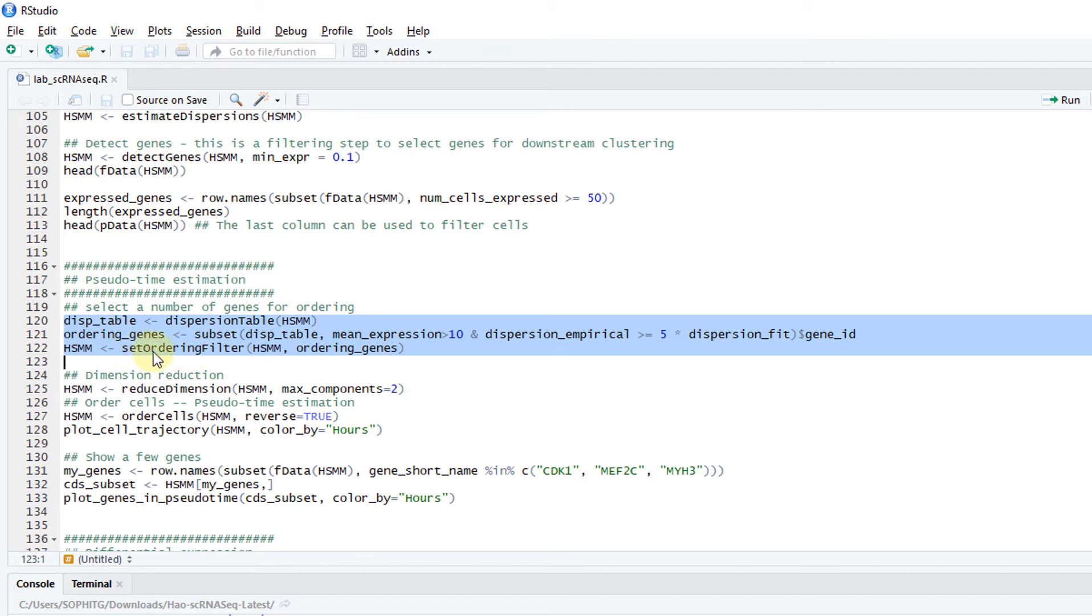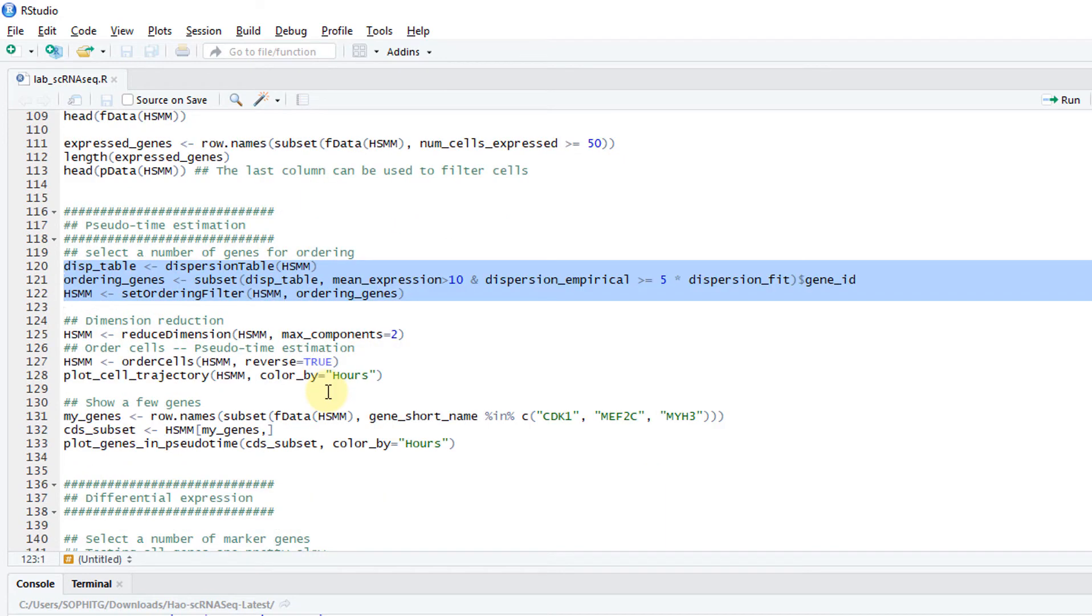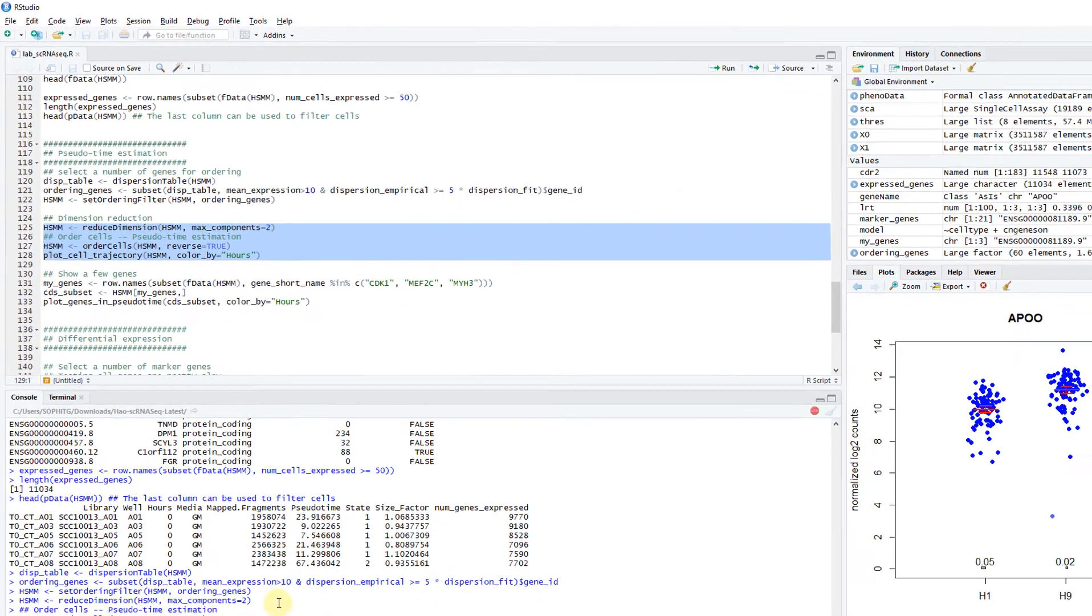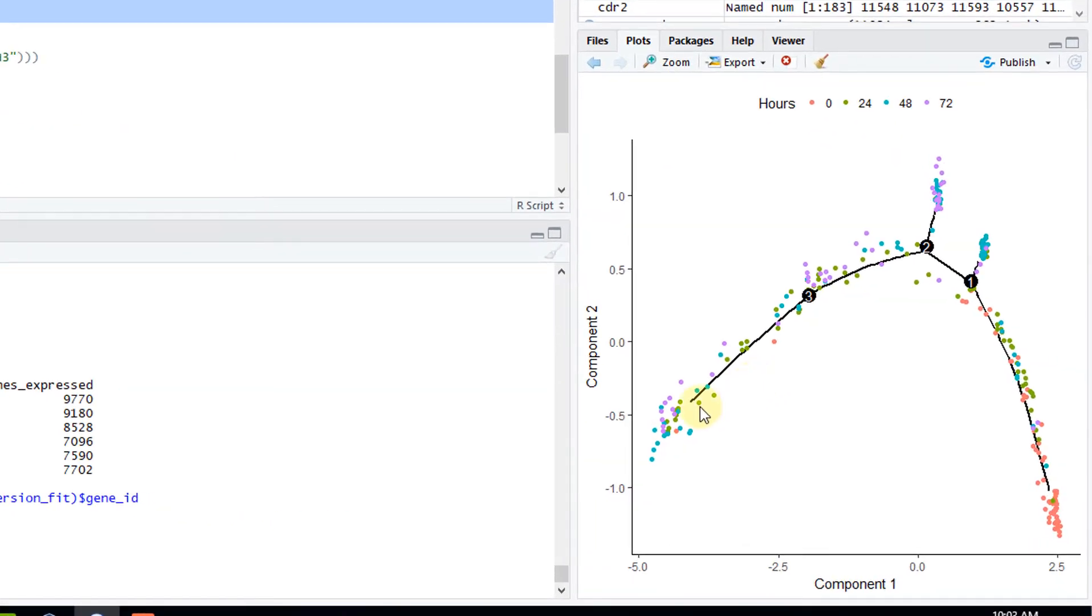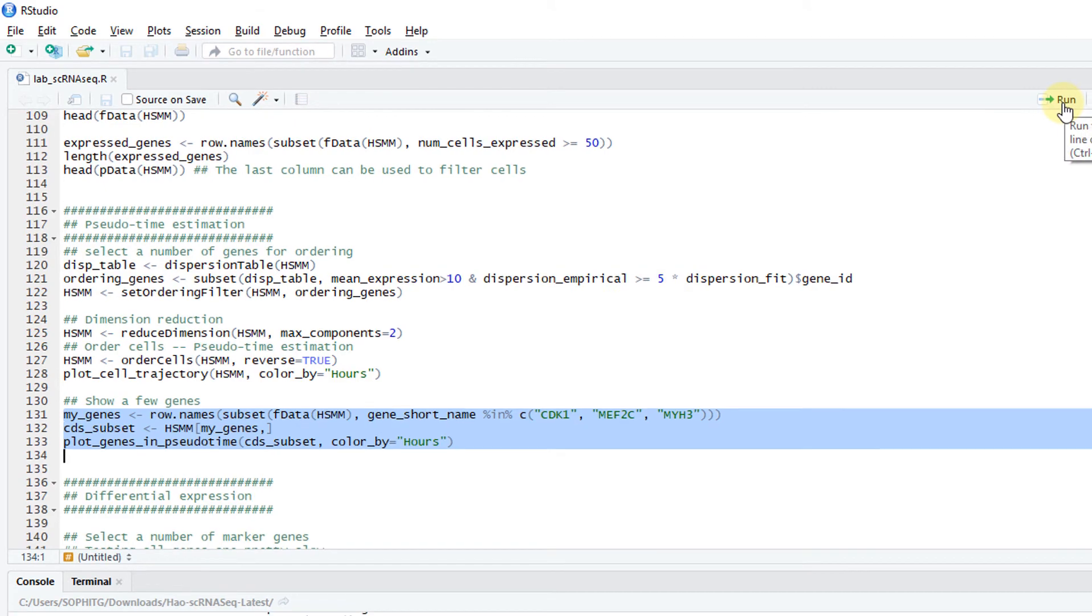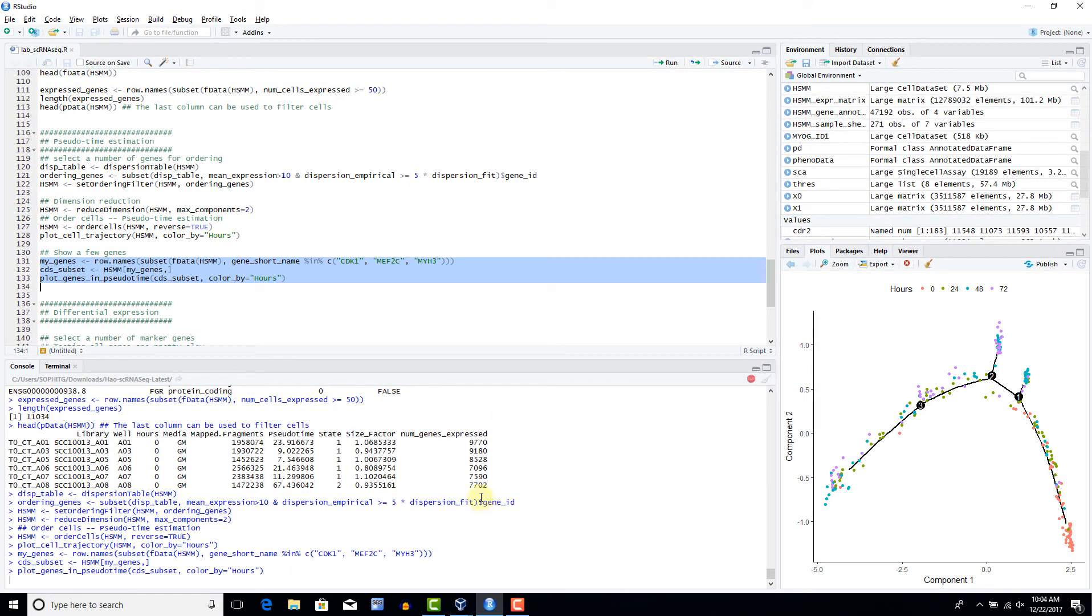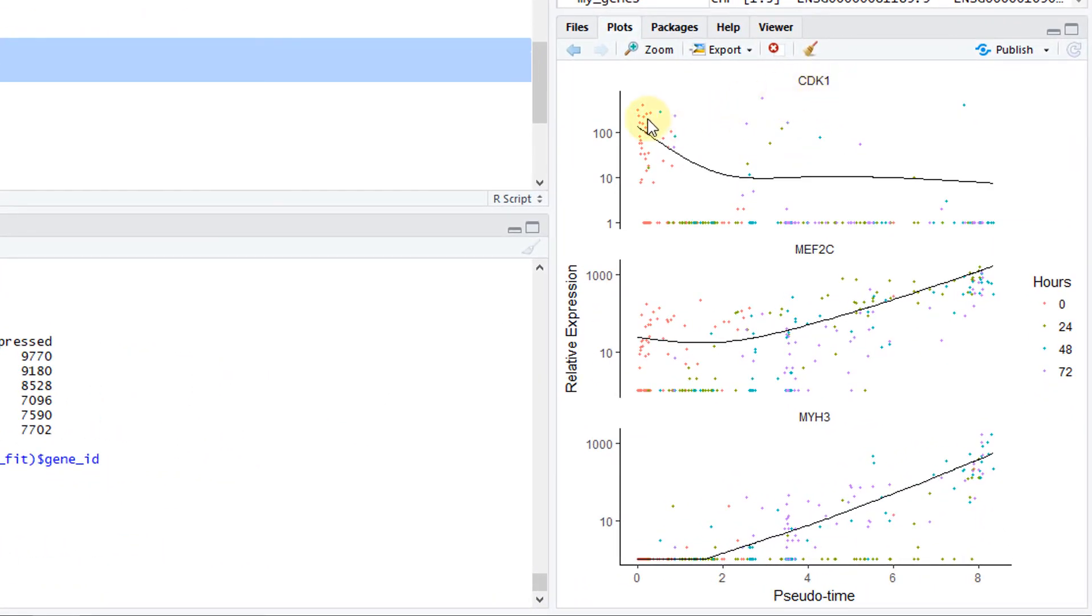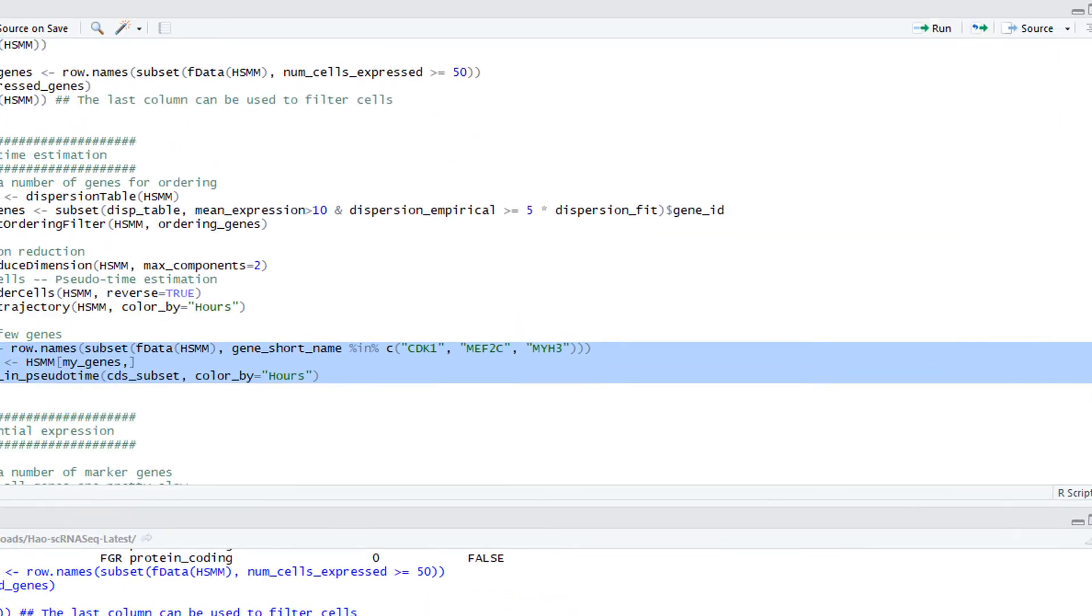We can run this a few lines. Then you use this command, set ordering filters. These are the genes used, the marker genes used for estimating the pseudo-time. Then do a dimension reduction. Then order the cells. Here's a pseudo-time projection. These are kind of the PC plot. It assumes that the time goes like this. Then there's some little branches. You can show the profile for particular genes under the pseudo-time. You can see this one gene is CDK1. The pseudo-time goes like going down. This is another gene that goes up. This is another gene that goes up.